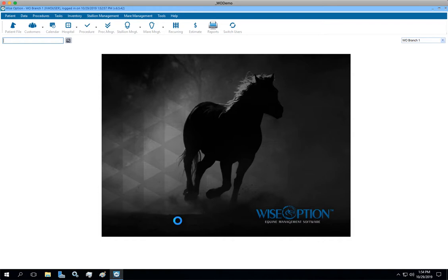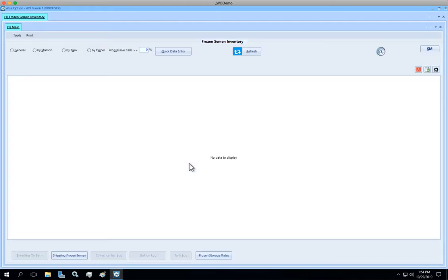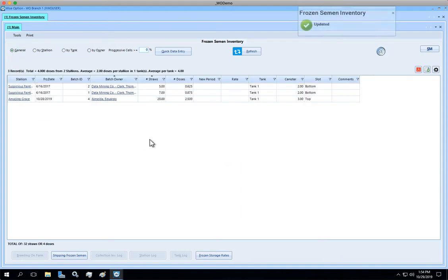Let's explore some tools in the inventory that come in handy when you are operating with your batches of straws. So we're going to click on the frozen semen inventory, Stallion management frozen semen inventory. As soon as you get there, let's take a look at all straws.